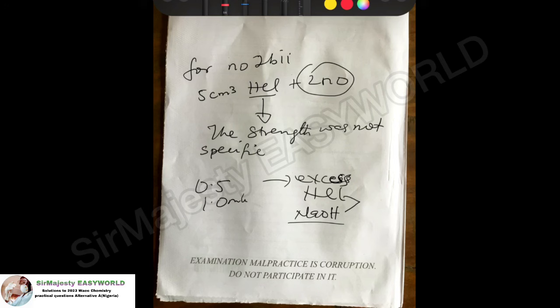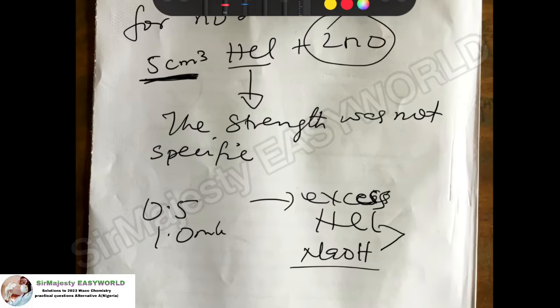So if the acid happens to be stronger than normal, I'm suggesting that WAEC specify the strength, tell the teacher to provide the dilute acid of a given strength and do the measurement themselves. When they say 5 cm cube, they have estimated the number of moles, to avoid a child having excess acid which will consume the base when he's adding in drops, and the person will be forced to report no visible reaction.